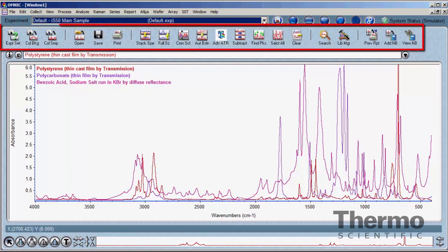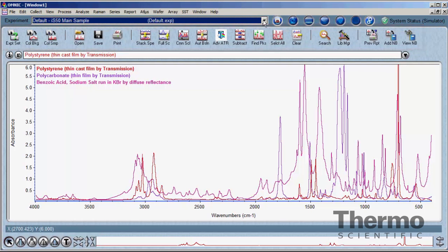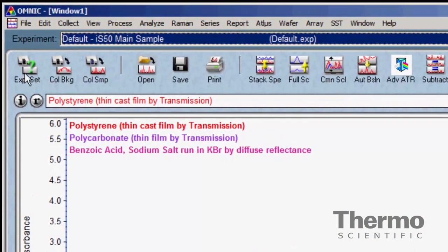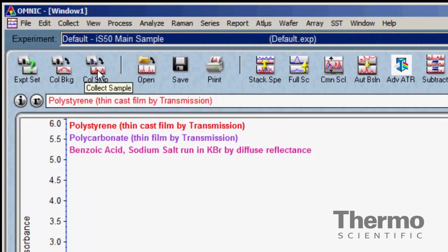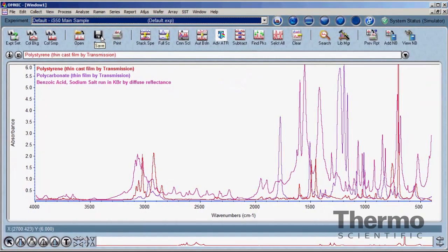The region below the experiment bar contains a collection of icons — this is the icon toolbar. Each icon displayed is a shortcut to a command on one of the menus. The icon toolbar can be customized to add, change, or delete commands displayed to make the OMNIC software more useful for each experiment performed. Populating the icon toolbar with frequently used commands allows for more efficient use of the software, speeding up the analysis. Customizing the icon toolbar will be covered in the configuration tutorial.